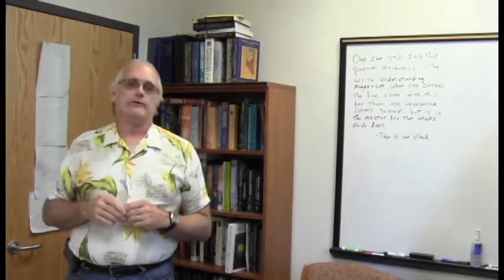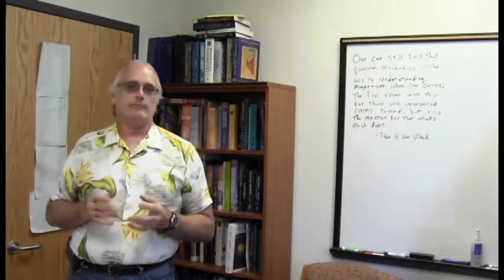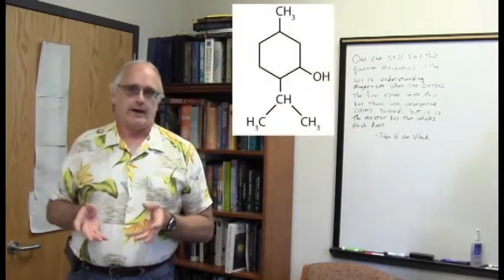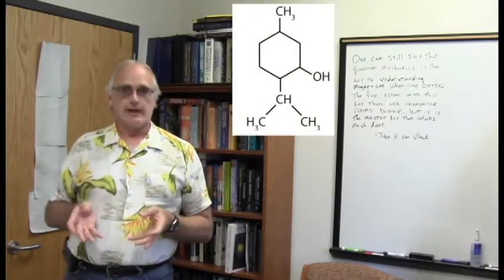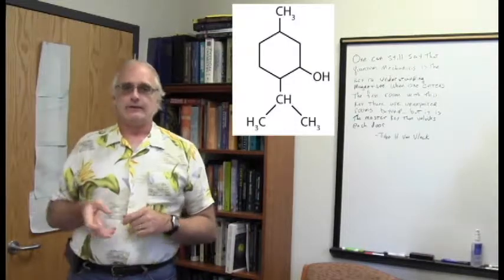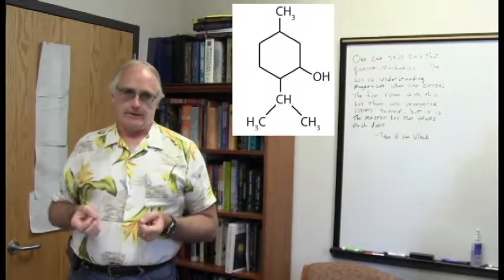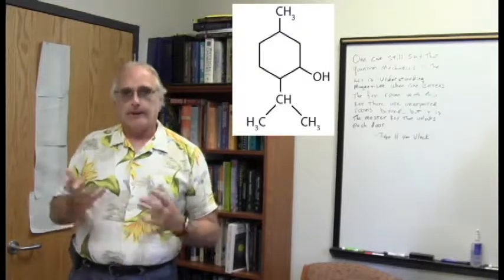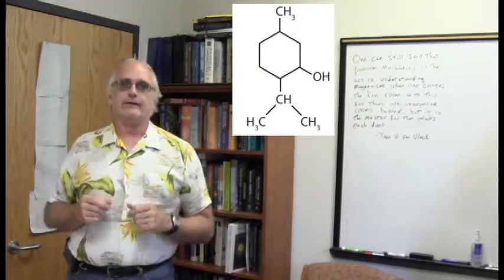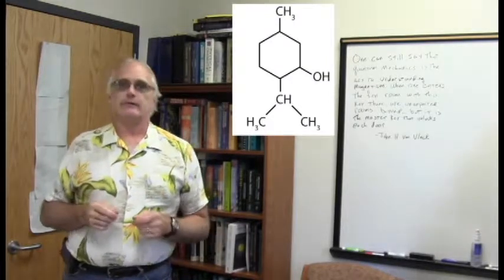We are going to do a full characterization of a natural product, though, a much simpler one, menthol. It's the peppermint extract. And in fact, we are going to look at the spectra that you saw acquired several weeks ago in one of the introductory videos, where I took the peppermint extract and went down to the instrument, to show you a little bit about how the instrument operates. It's time to look at those spectra.